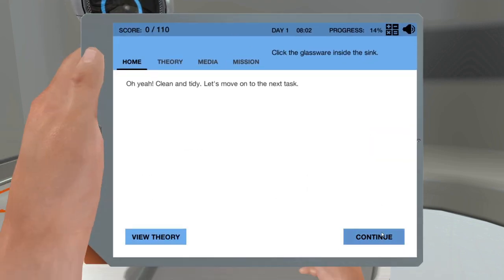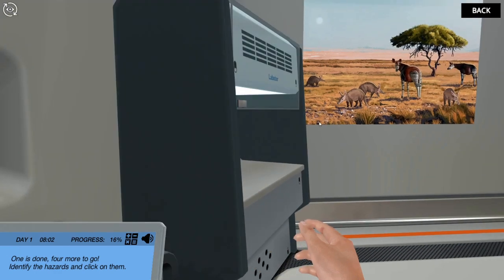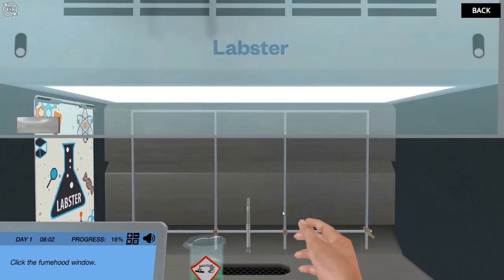This is the first thing. At every step it is going to tell me something or the other.